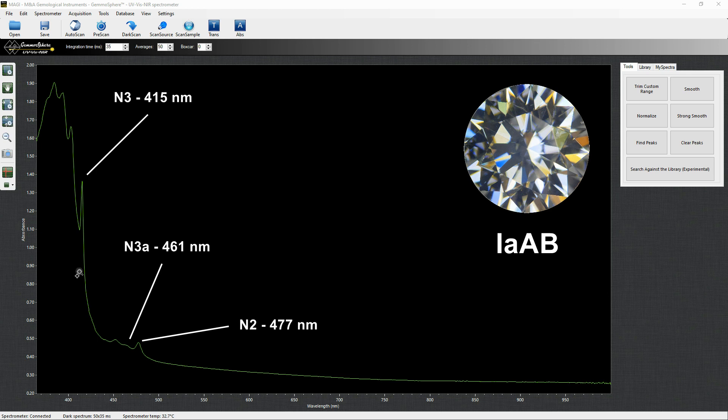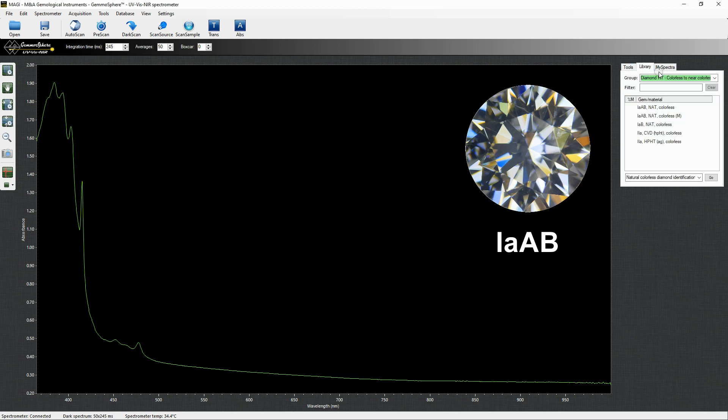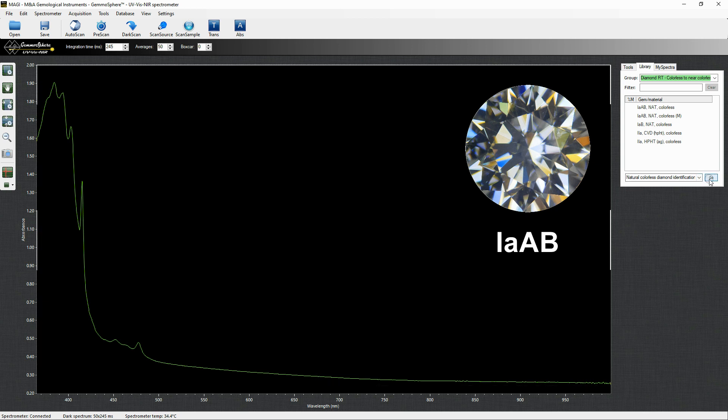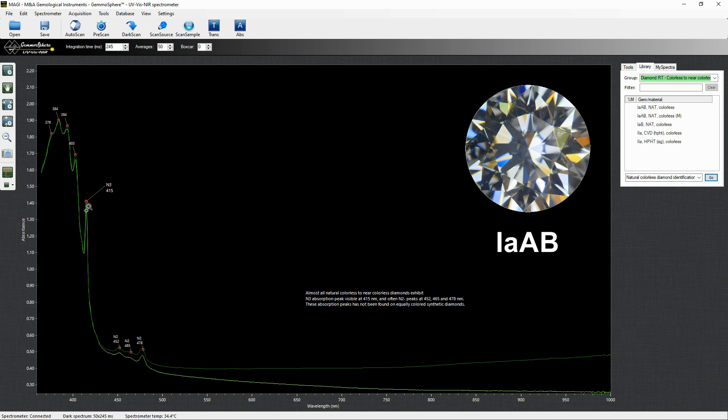Whenever the absorption spectrum of a colorless to near-colorless diamond shows those peaks, we can conclude the diamond is natural. By opening the colorless-to-near-colorless folder of the database, we can activate the natural colorless diamond identification application. The software will show a spectrum of a natural 1AAB diamond with all the diagnostic peaks highlighted and described.